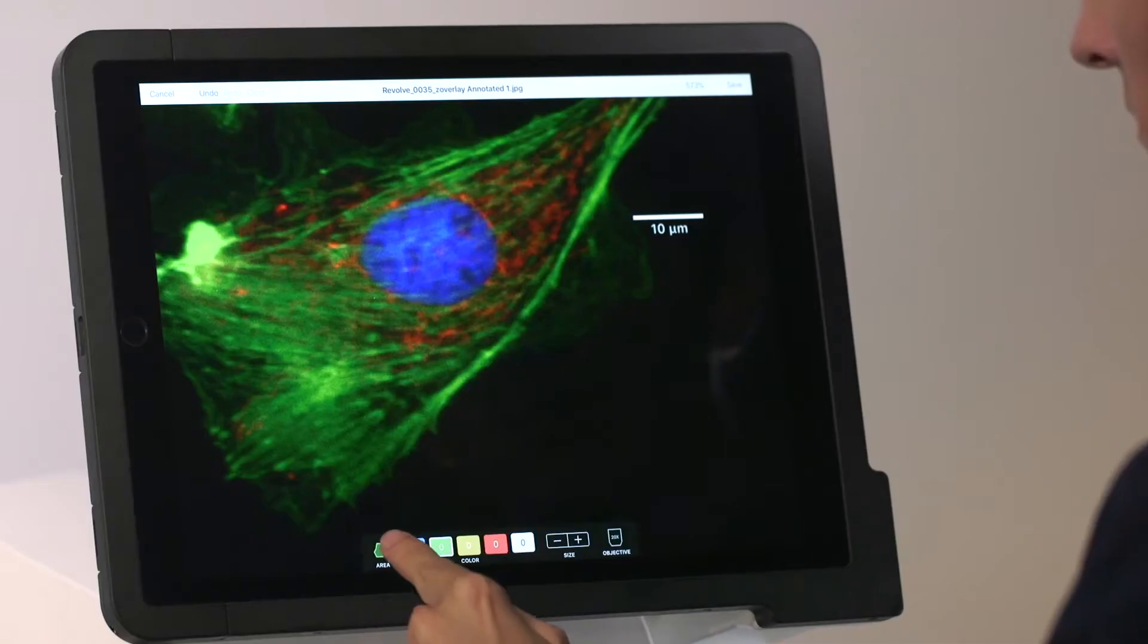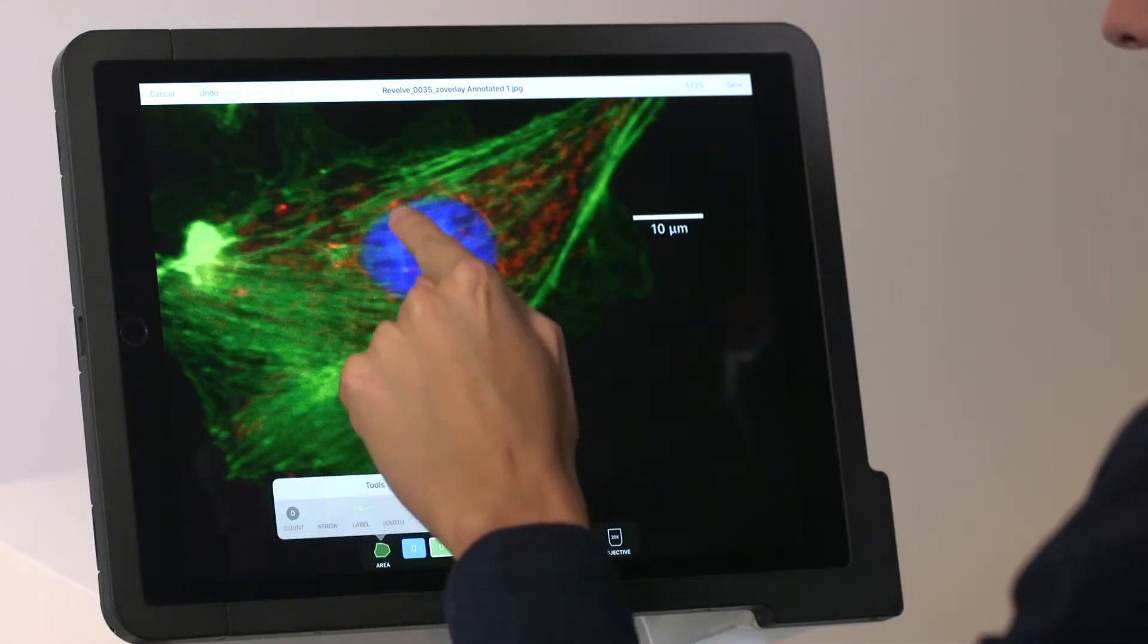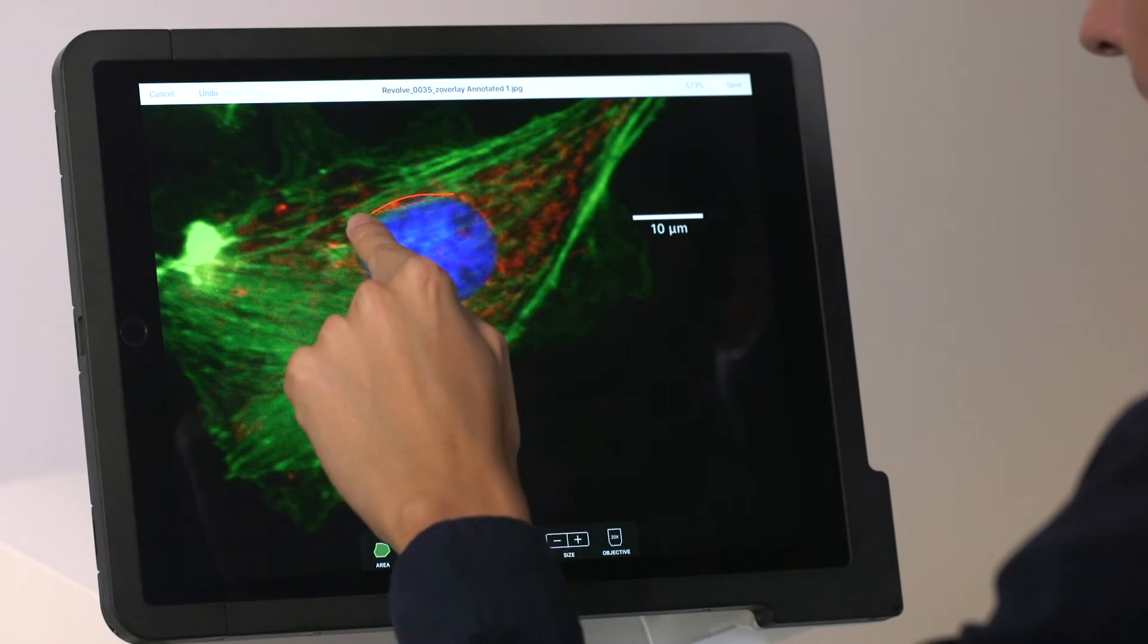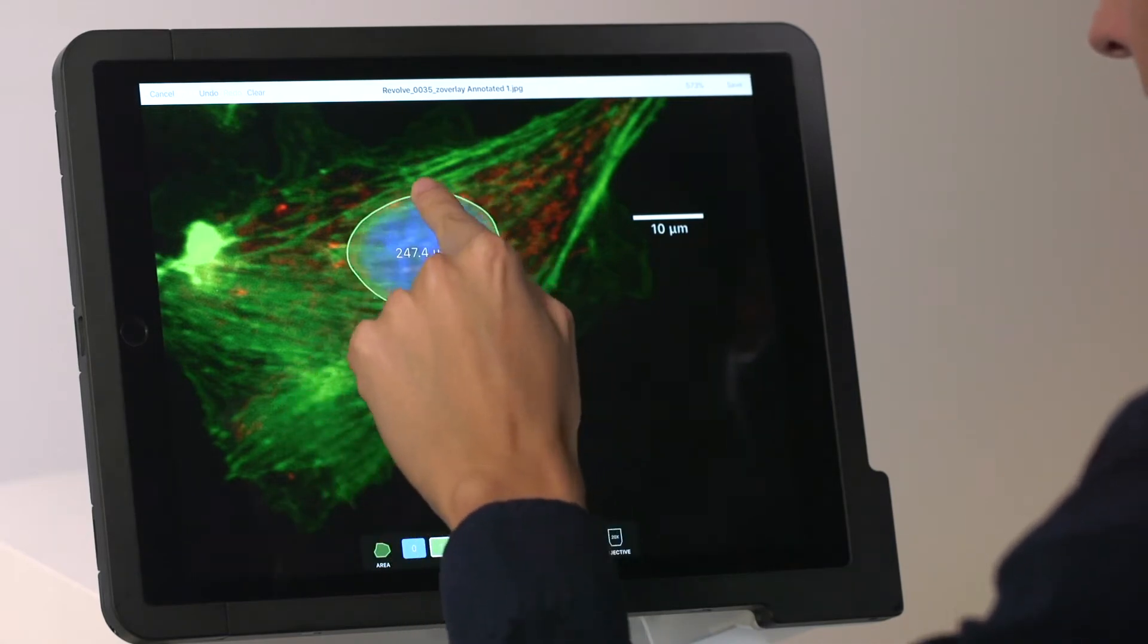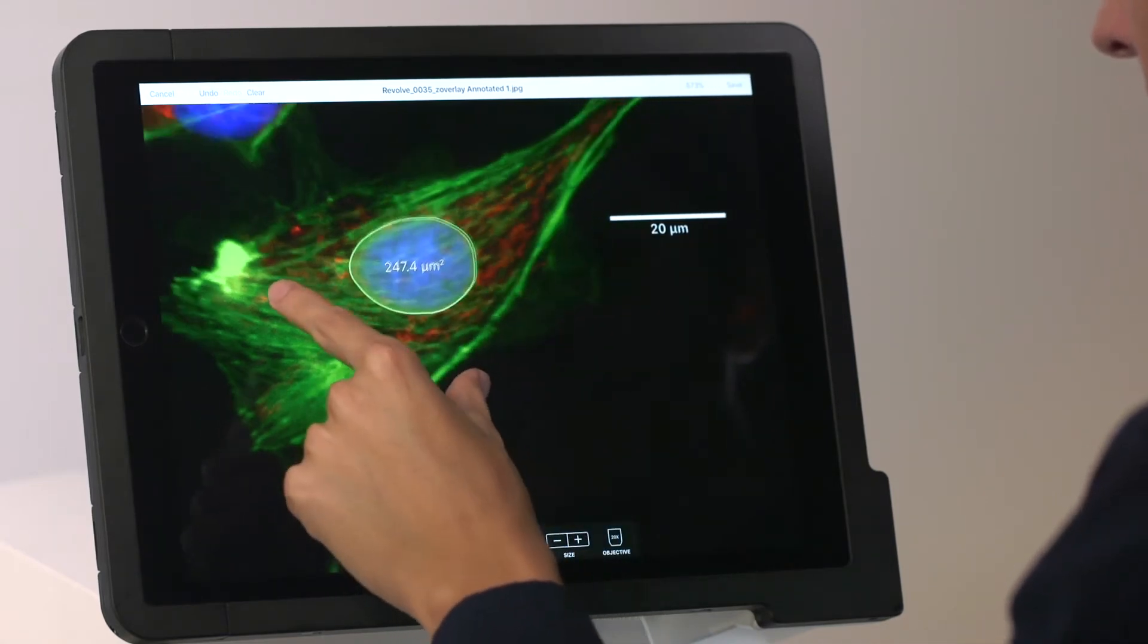Second, ease of use. We've developed our own app. By leveraging the iPad's touch interface, we have created a familiar workspace that's easy to use.